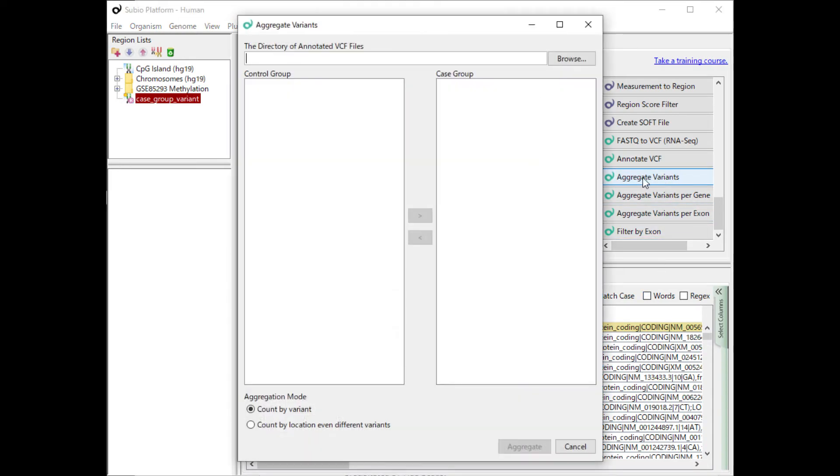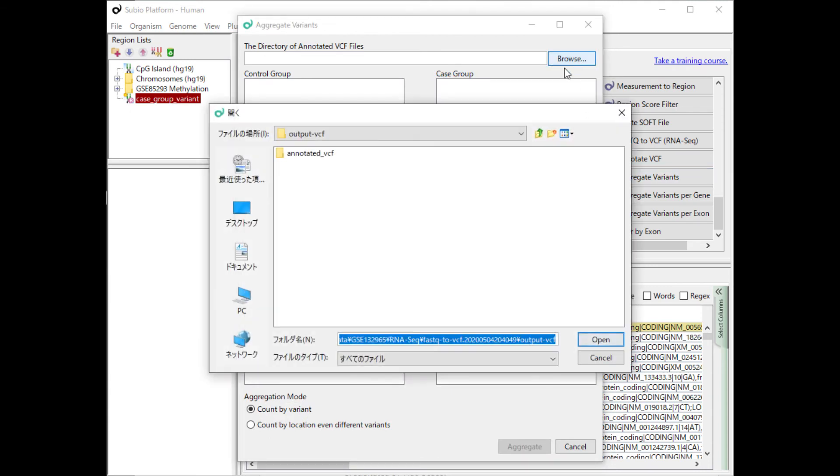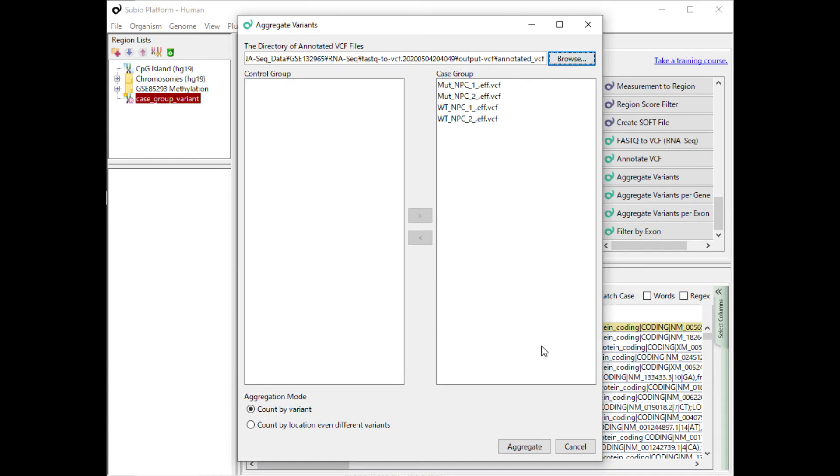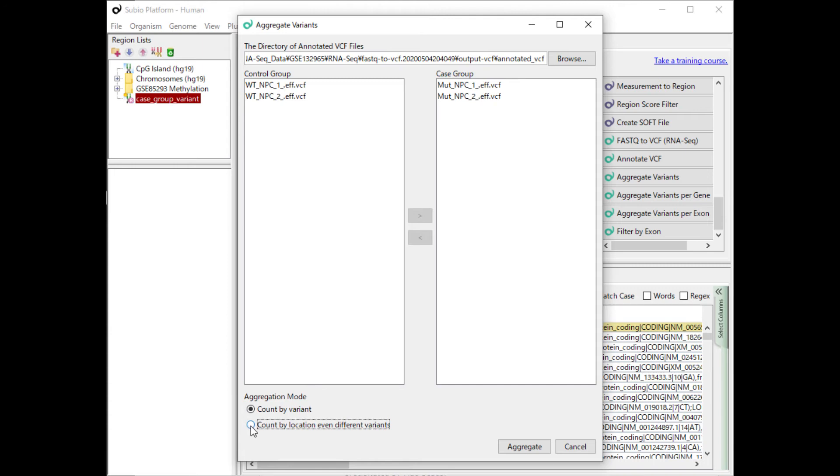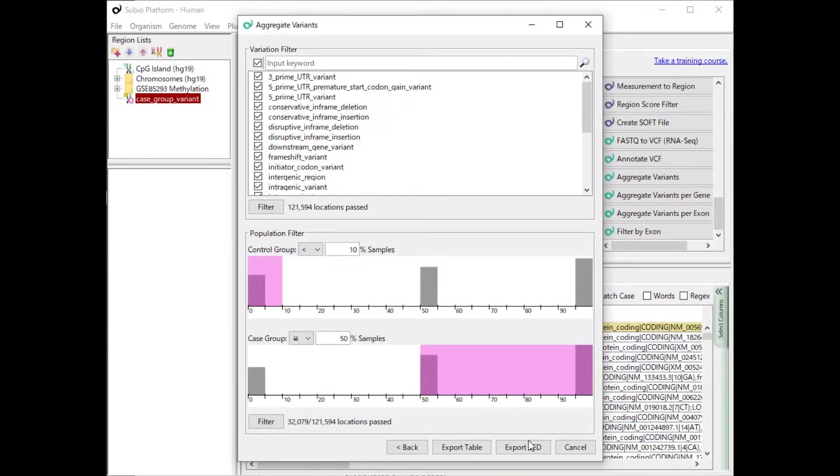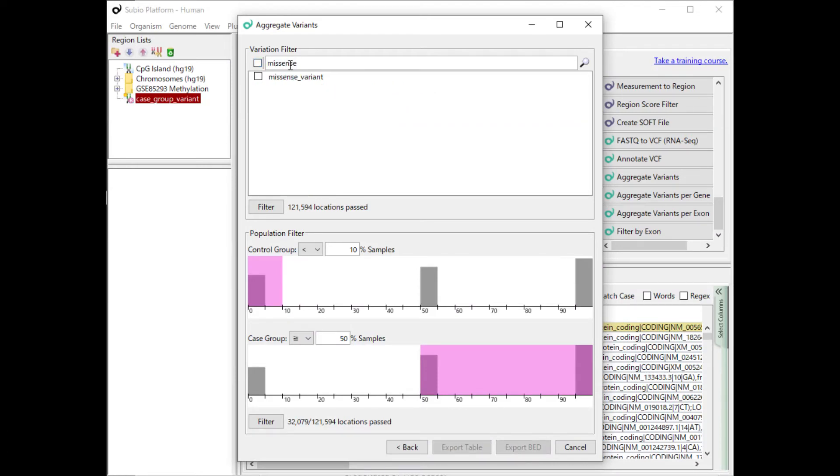Next, let's run it in count by location mode. As before, extract the missense and frameshift variants.